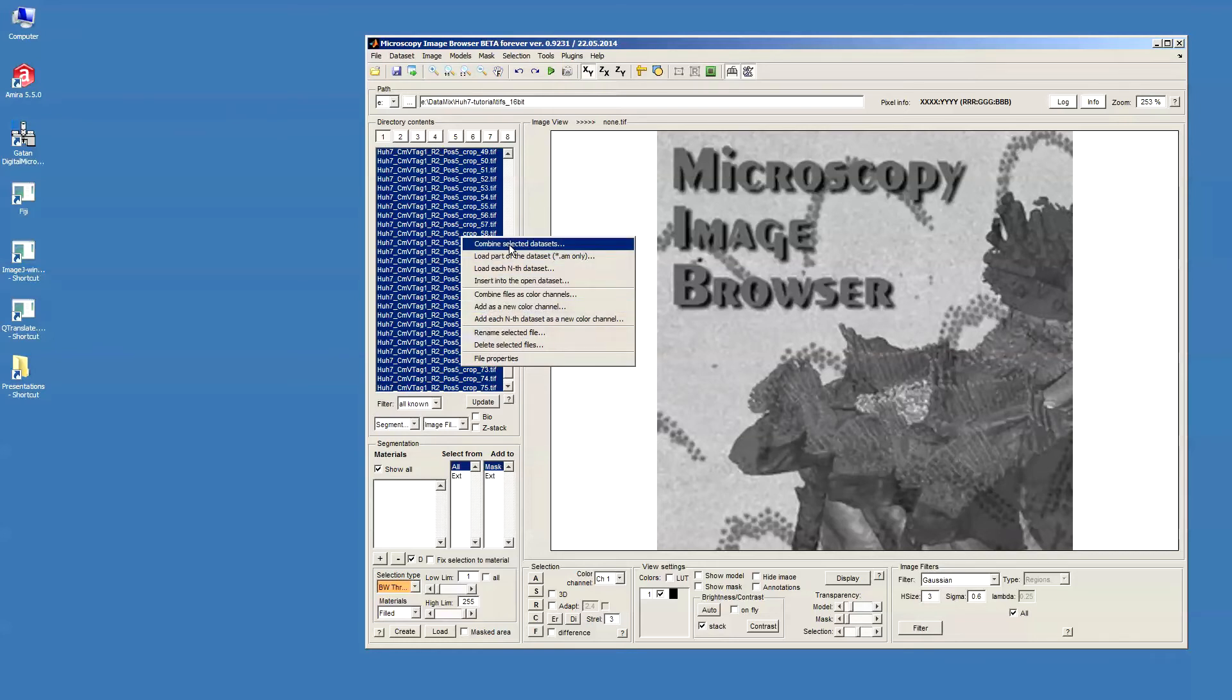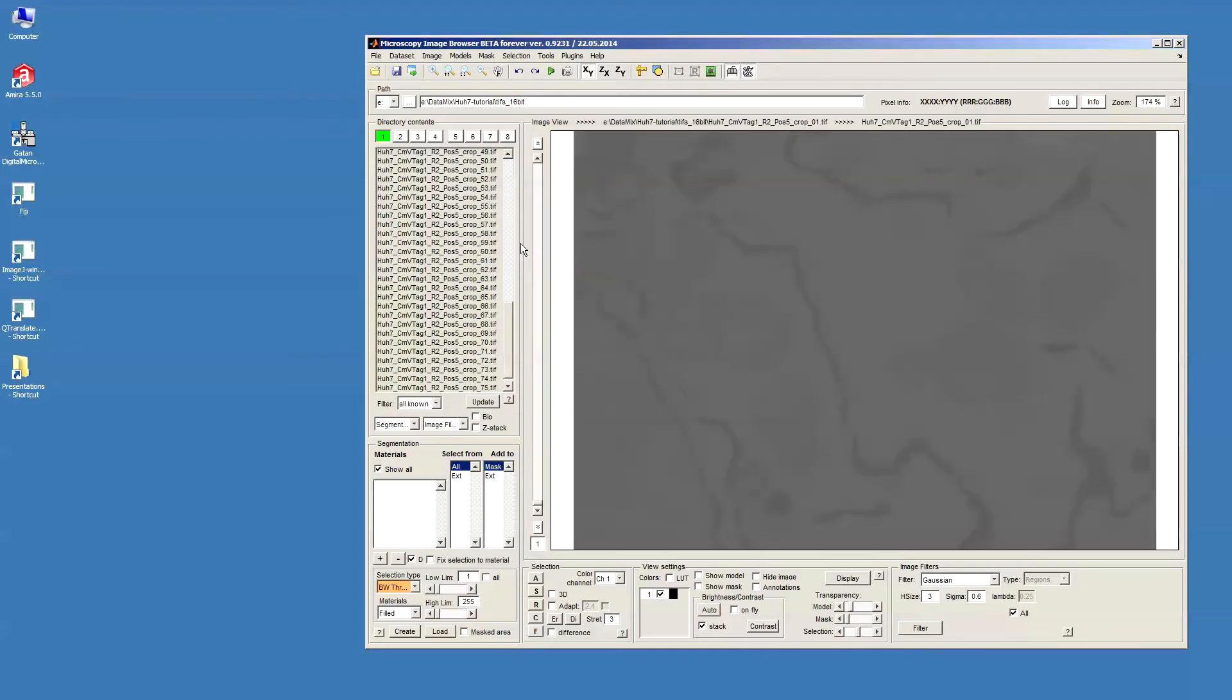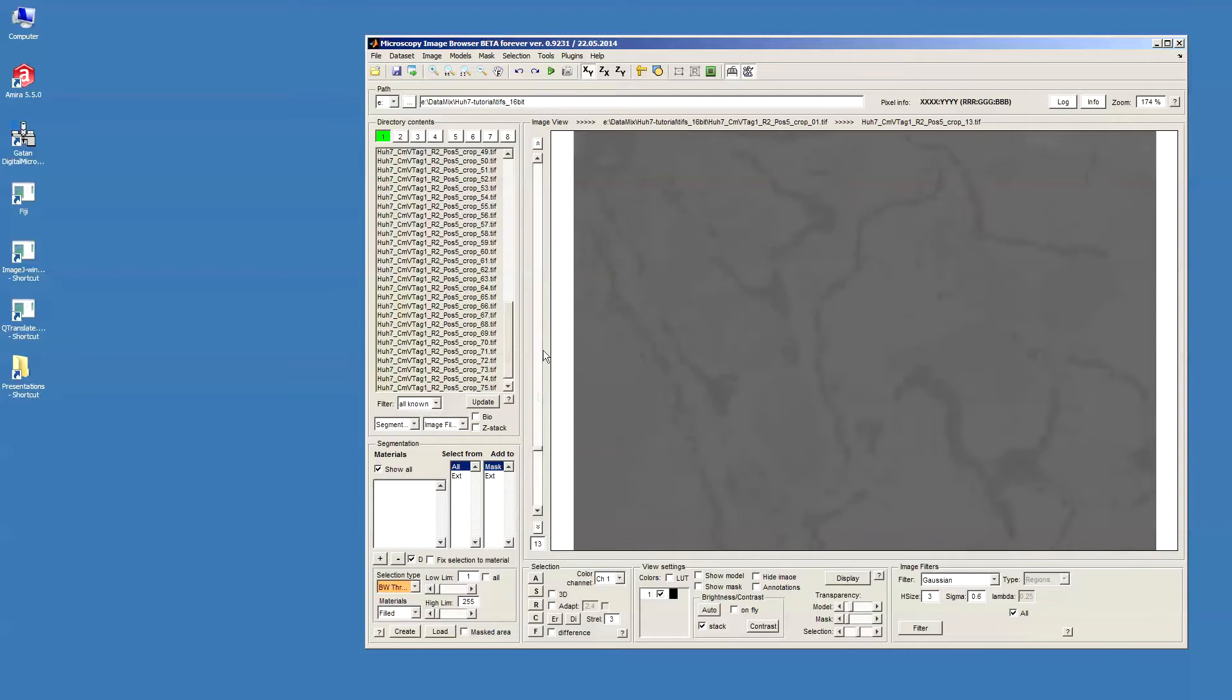In this pop-up menu, I select combine selected datasets. Now the data is open as a 3D stack and we can see it by moving the slider or the mouse wheel.